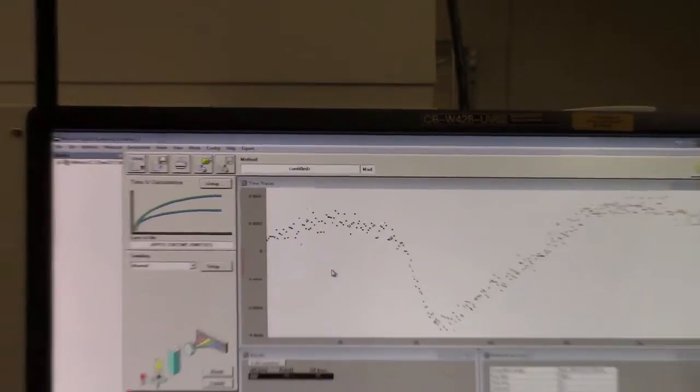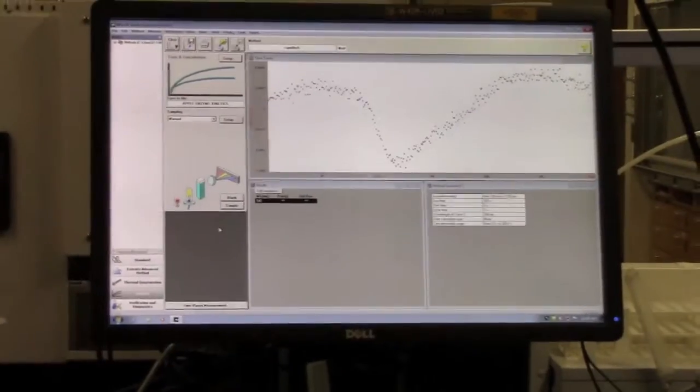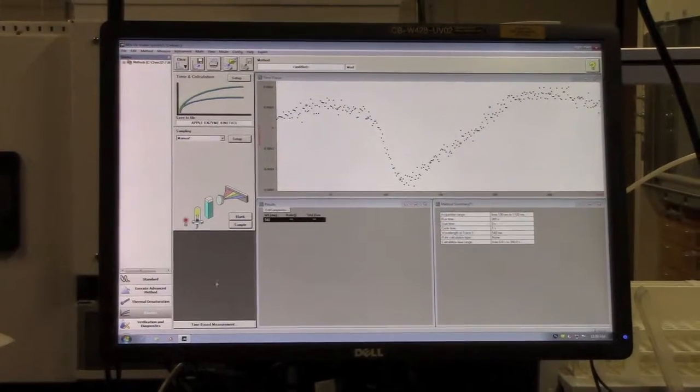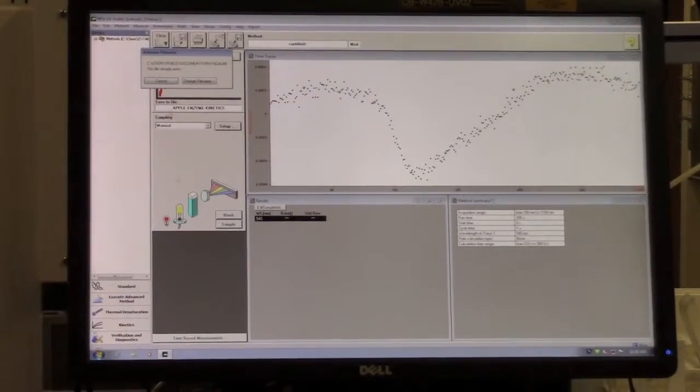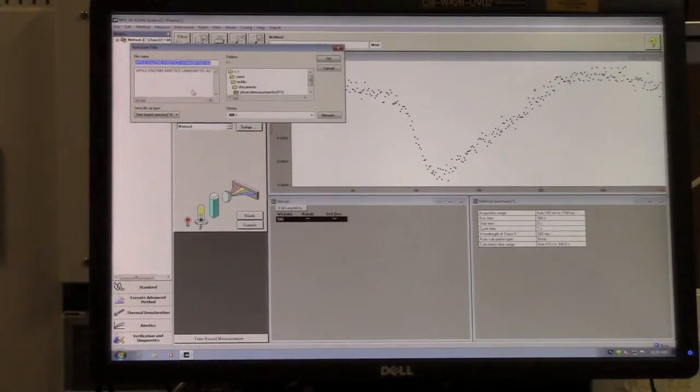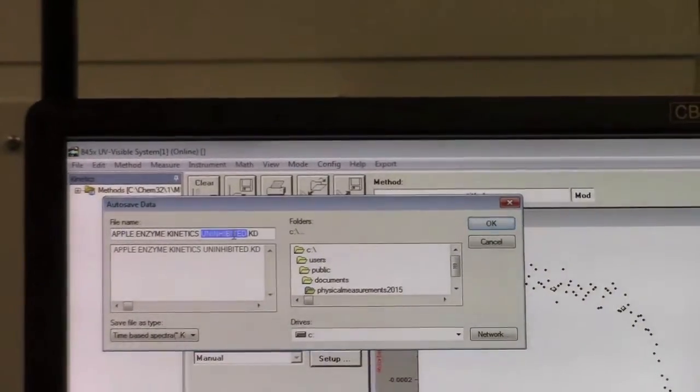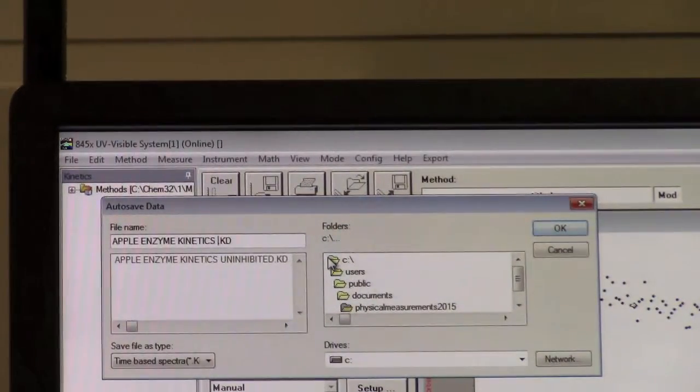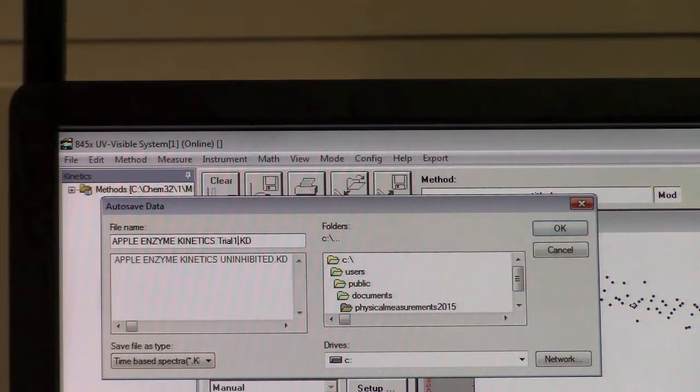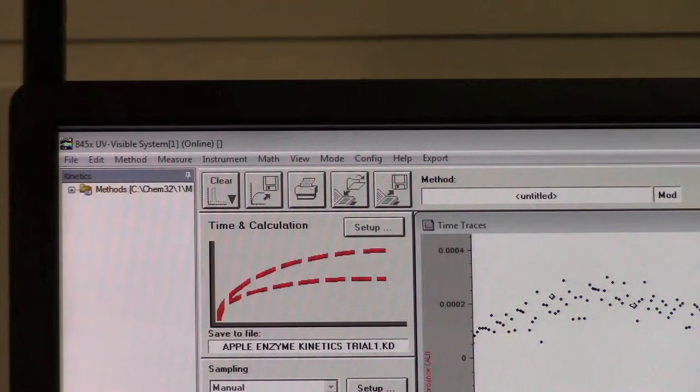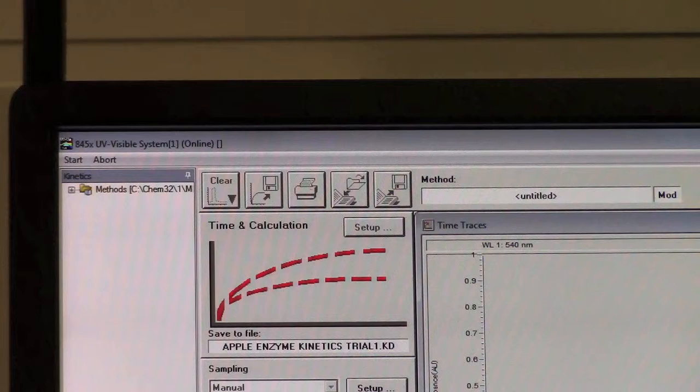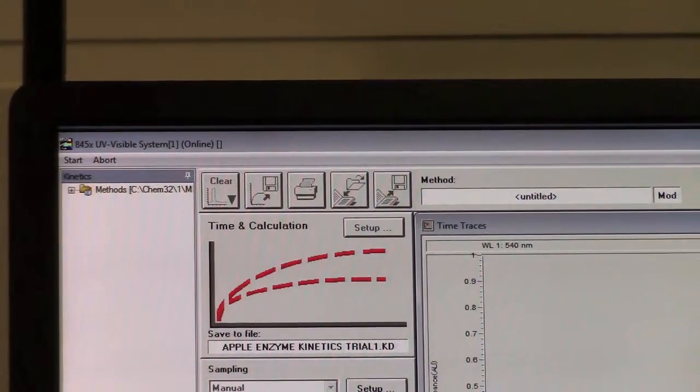To take the next measurement, once you have reset your cuvette, click on Time-Based Measurement again. Click Change File Name and name it descriptively for the particular trial you are doing. For example, you might name it Trial One. You'll be prompted again that the shutter will remain open the entire time; click OK. Once you've added the enzyme to initiate the reaction, click Start and the process will repeat.